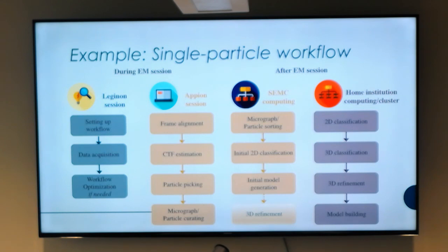Also, it's really a matter of preference, but my particular preference is that you don't be so severe in particle selection early on, and unless you have prior knowledge or orthogonal knowledge, it's okay to carry data forward and then try to do more sorting later on.